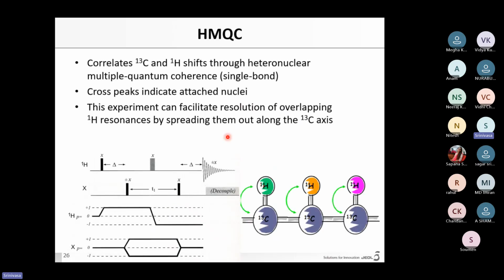It is very useful, and most synthetic people use it, as it is a fast and quick experiment. Within 15 minutes you can finish the COSY experiment and get the data. So you can finally identify whether the synthesized molecules are going in the right direction.